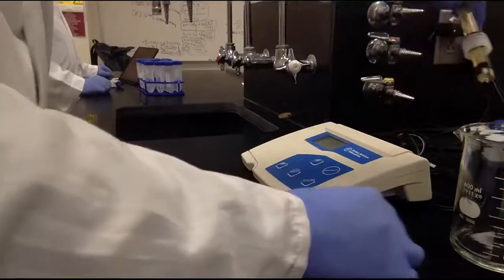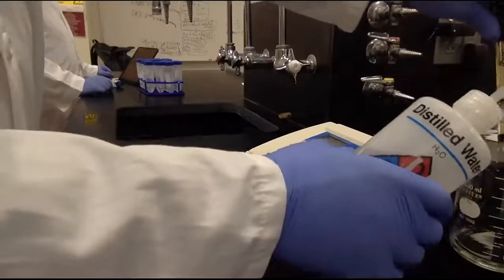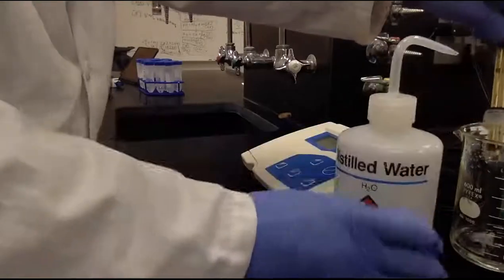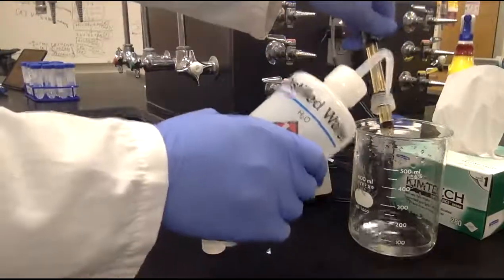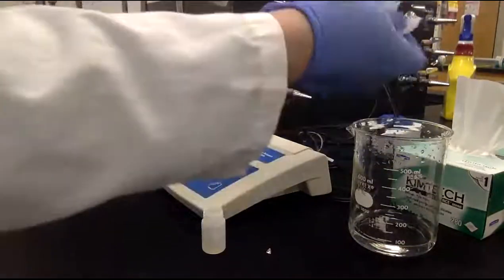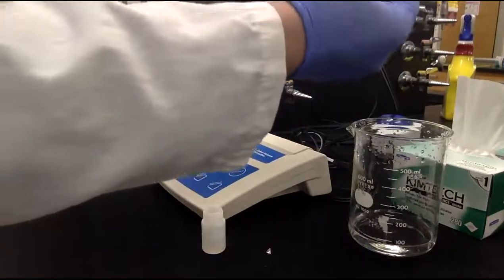And if you notice, there are some solutions on the probe. So that's why we need to use the squeeze bottle, which has distilled water, to wash. I'm not sure if you guys can see it, but a little bit. Make sure you rinse it with a lot of water to get rid of all the potassium chloride on it. Then after that, you use the clean wipe to wipe all the water left on the probe.